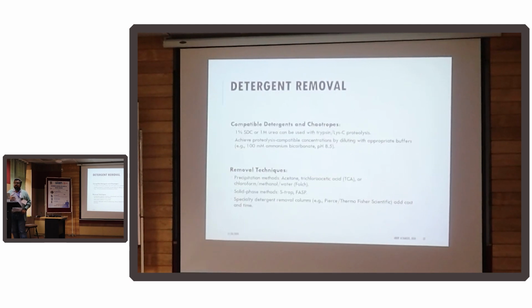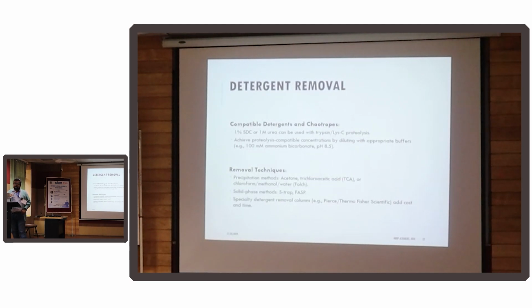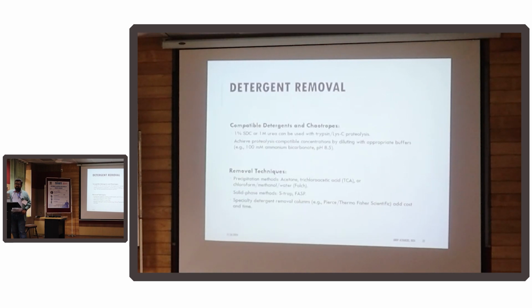A lab, what others have done. Sometimes, if you're in a rich lab, while standardizing, you can pick up 3 or 4 techniques. For the same tissue, you will have these 4 protocols or 3 protocols, and you try to run the 3 or 4 samples derived from these techniques on a mass spec and see which gives you the best proteome coverage, how many proteins you can identify. No method is 100% foolproof.